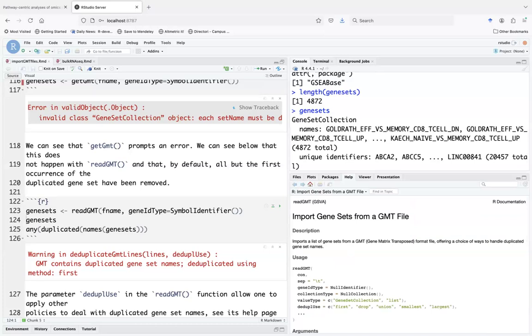They have the same name anyway, so just make a unique set out of all of them. Keep the smallest, keep the largest, and so on. So you have the choice of a couple of strategies to resolve this issue, and you end up with an object afterwards that you can work with and not just an error message.